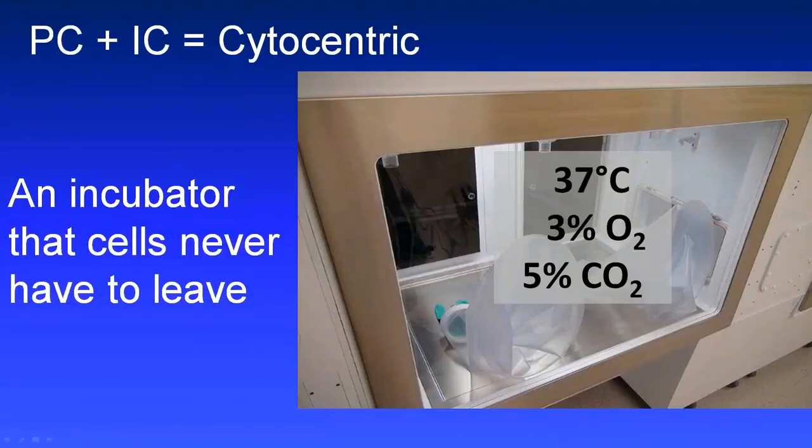The processing chamber and the incubation chamber together make a cytocentric space that is like an incubator. The cells never have to leave. You can do everything you need to do with them inside that space.